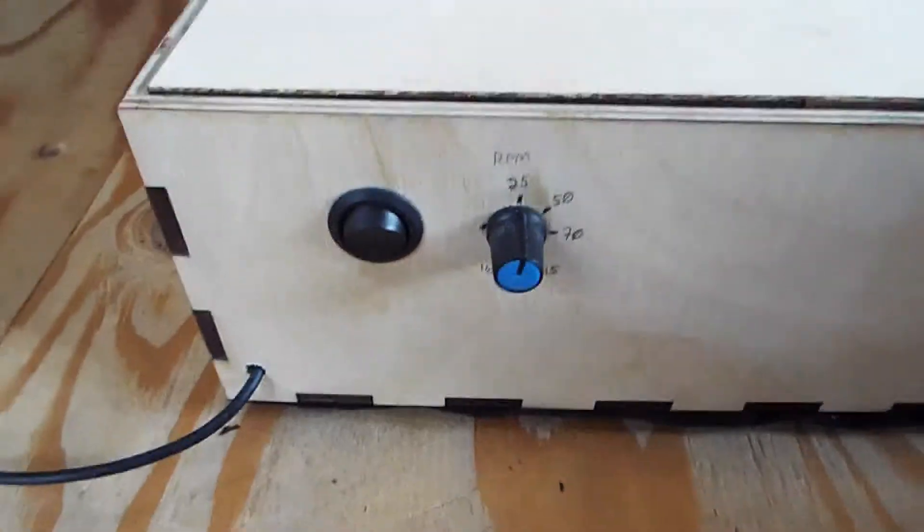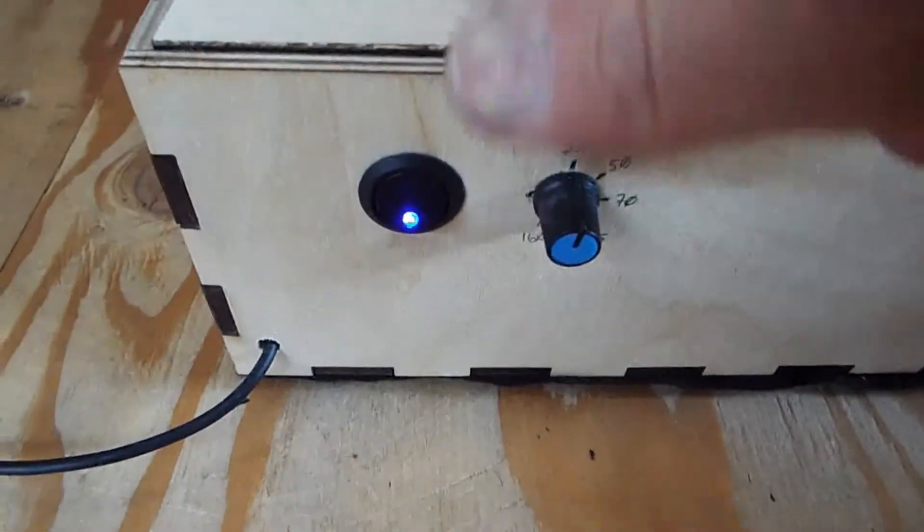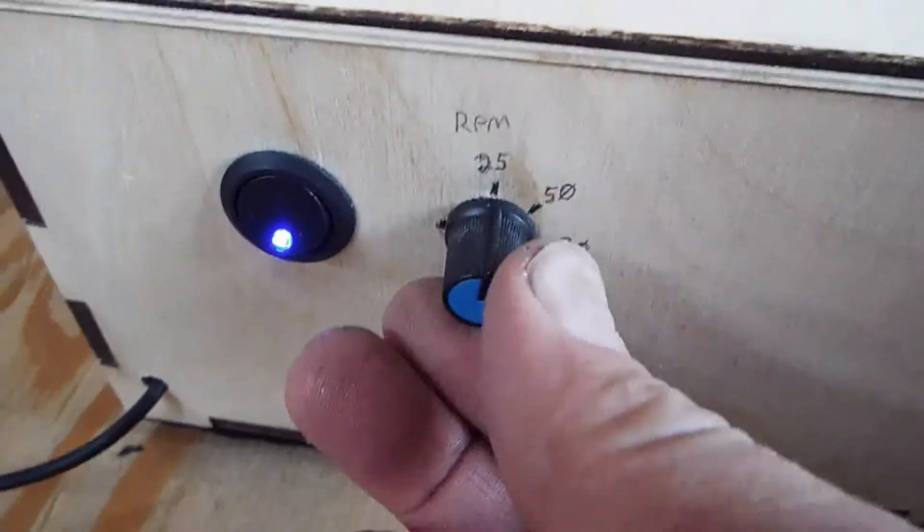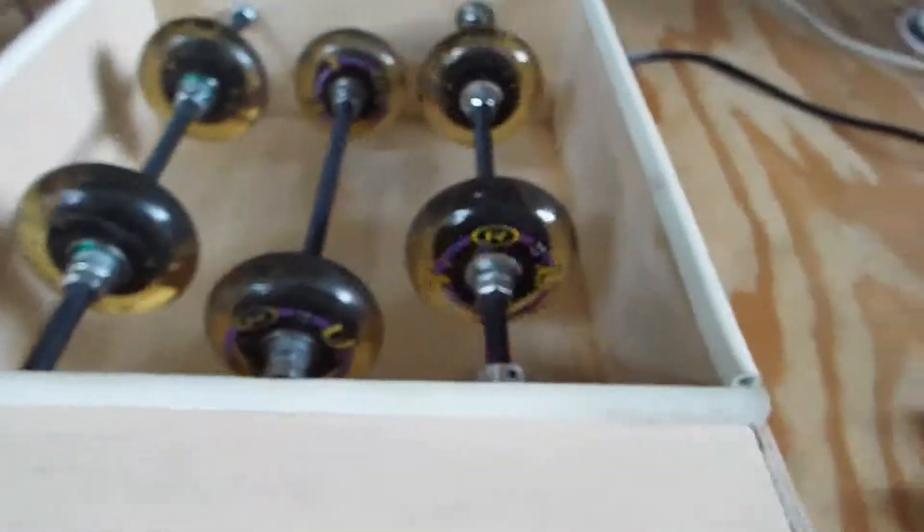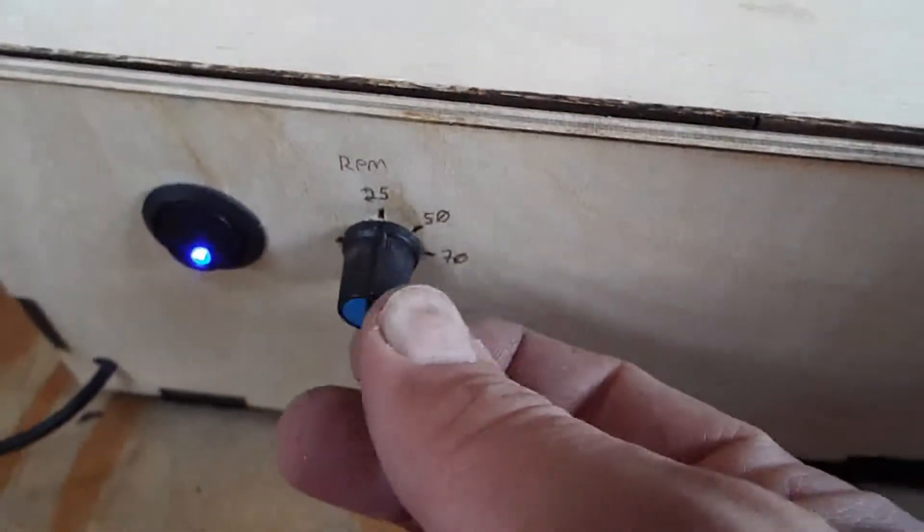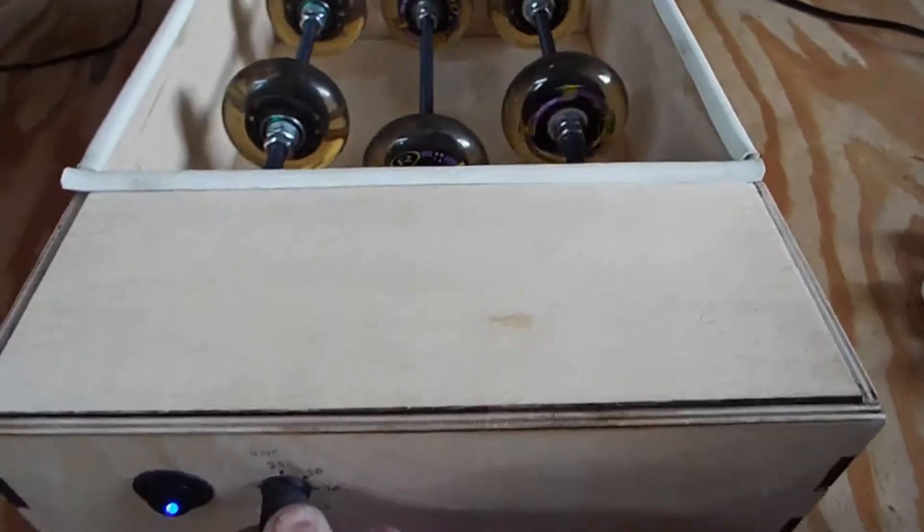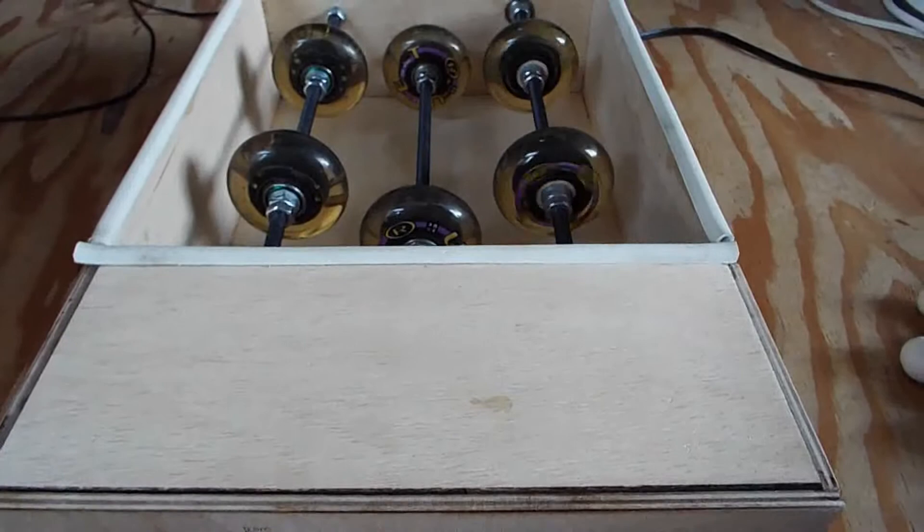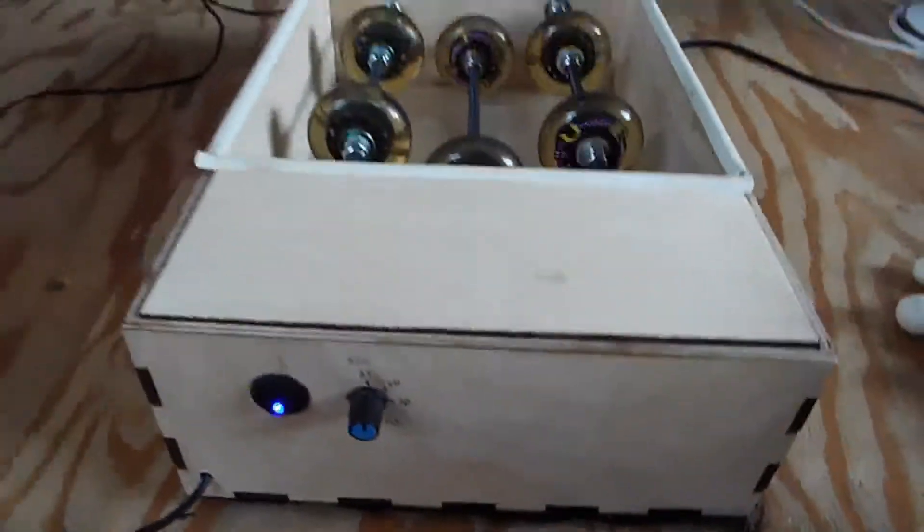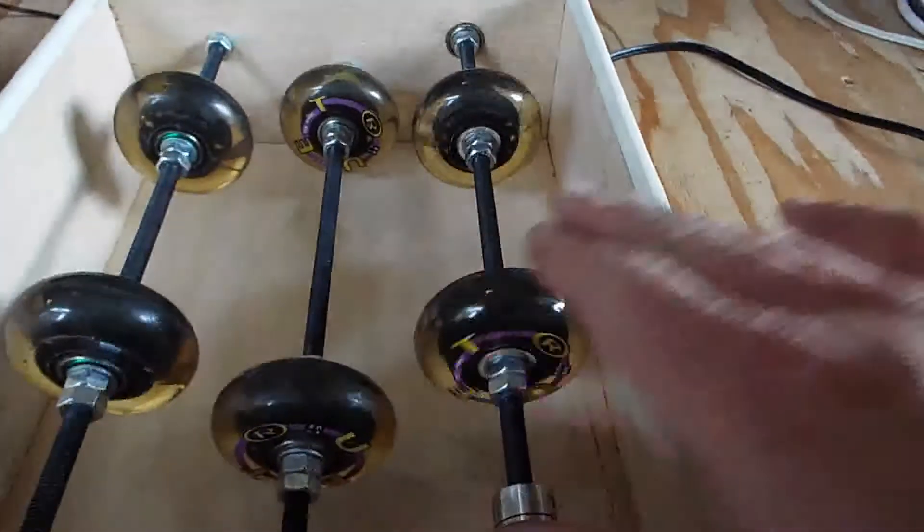So I have an on-off switch on this. And then I have a PWM control that controls the motor speed. Right now I have it at 25 RPM, but I can go all the way up to 160 RPM with this. So if I turn this knob... The 160 RPM is the jar RPM. That's not the shaft RPM here.